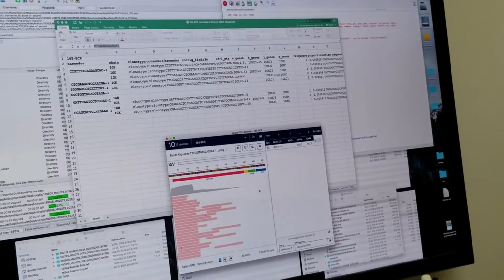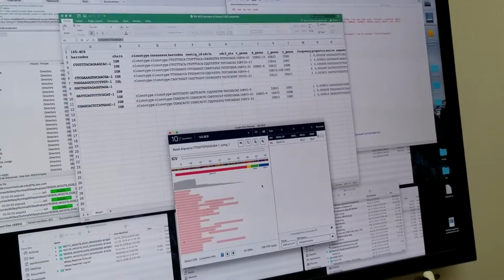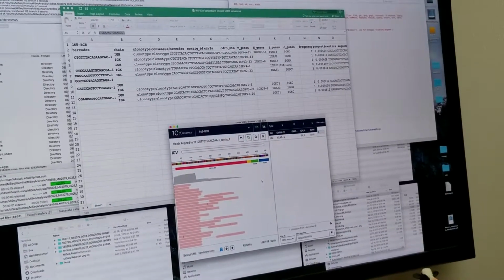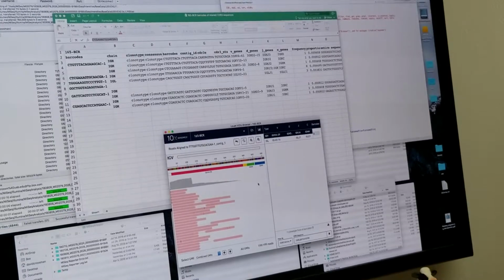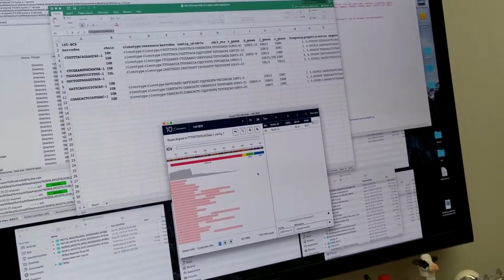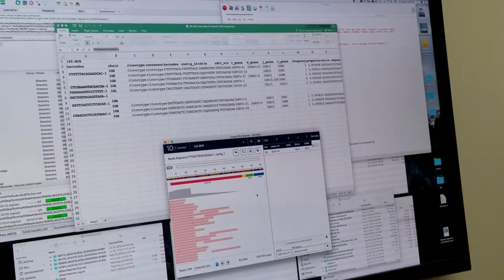The gene expression is 5', but I didn't think that the B cell receptor VDJ stuff is a 5' type assay. I have to think clearly about it. It looks like it should be full coverage across every VDJ, but you can see the reads. And maybe something was not done right in the kit. I don't know. That's something to look back at.